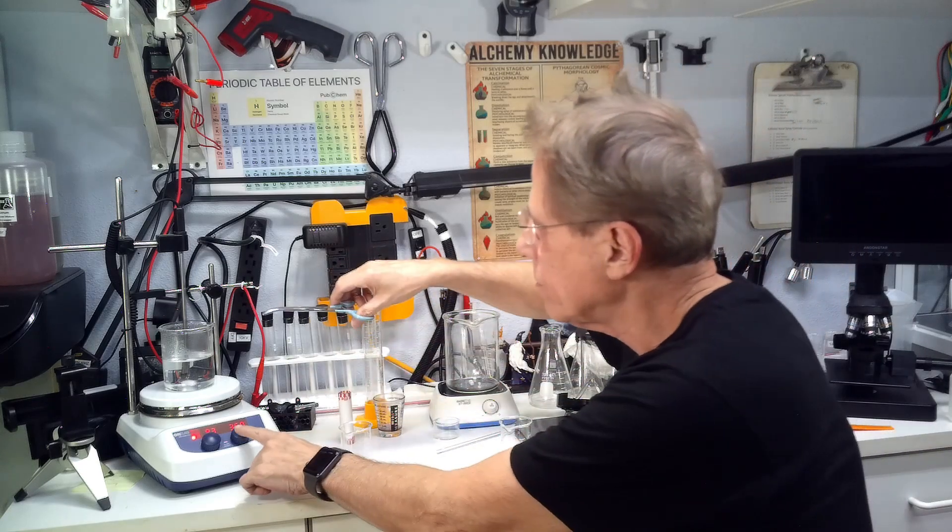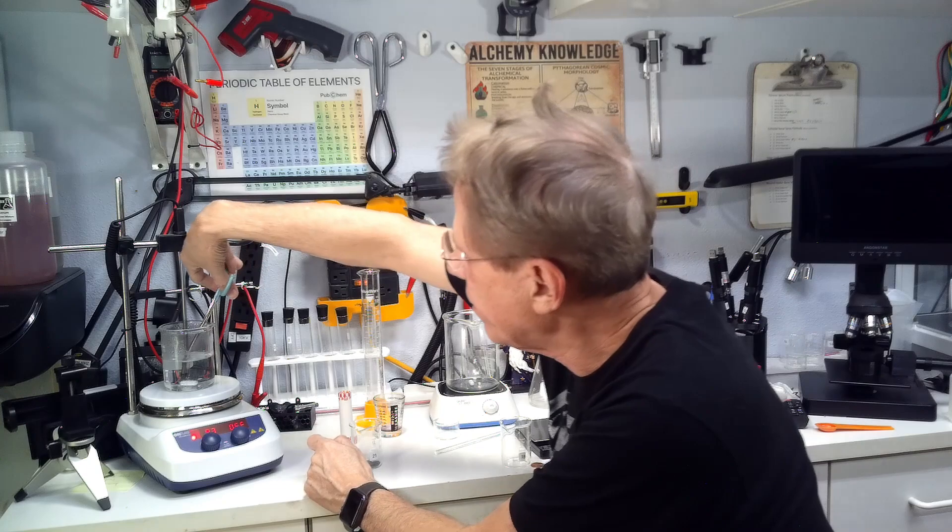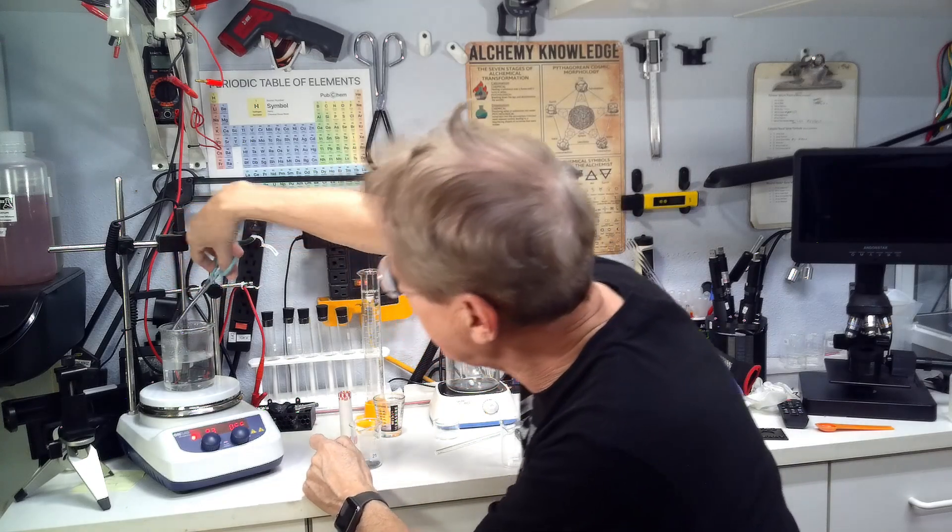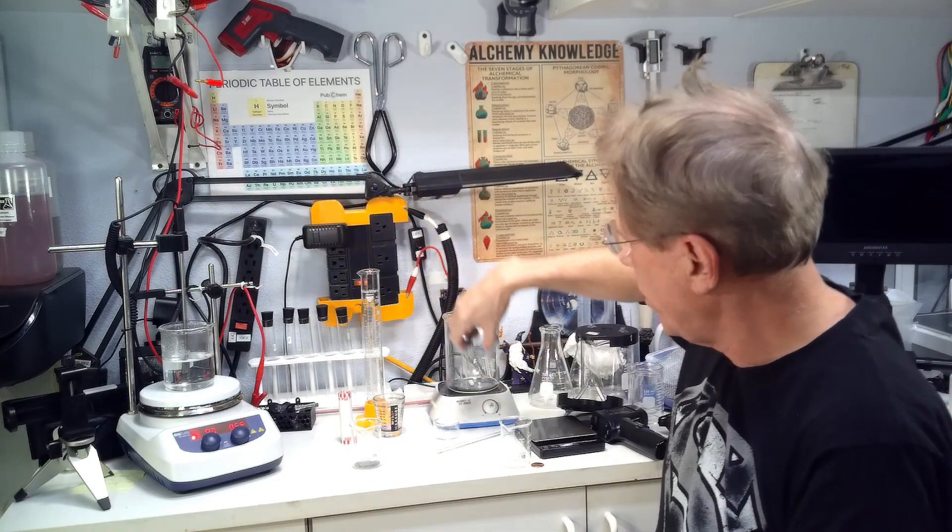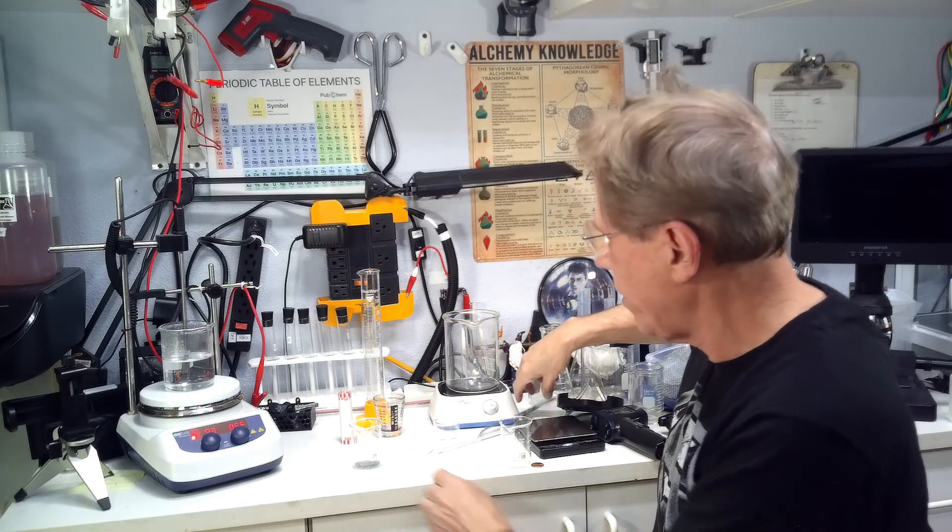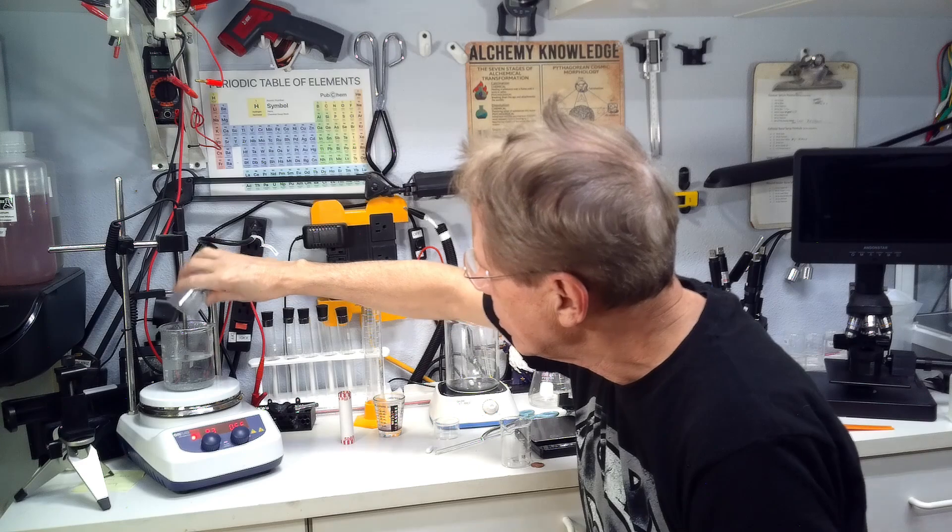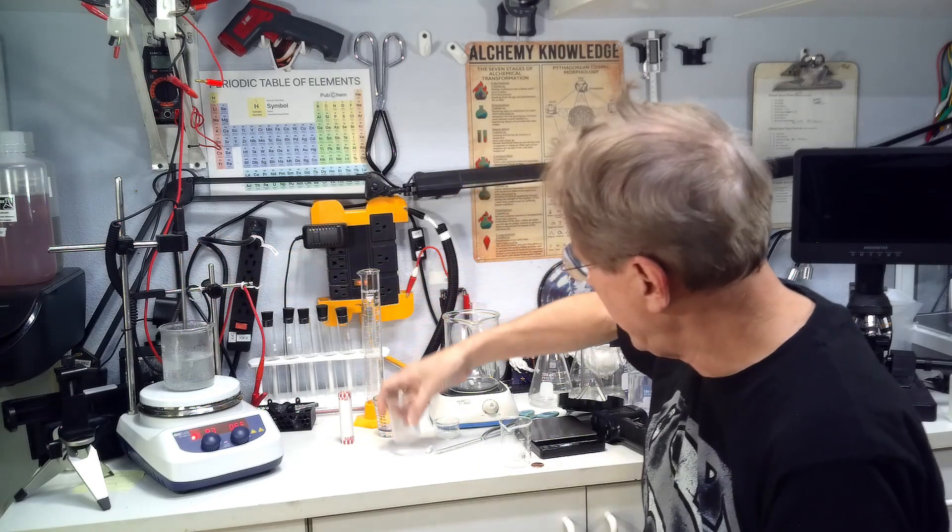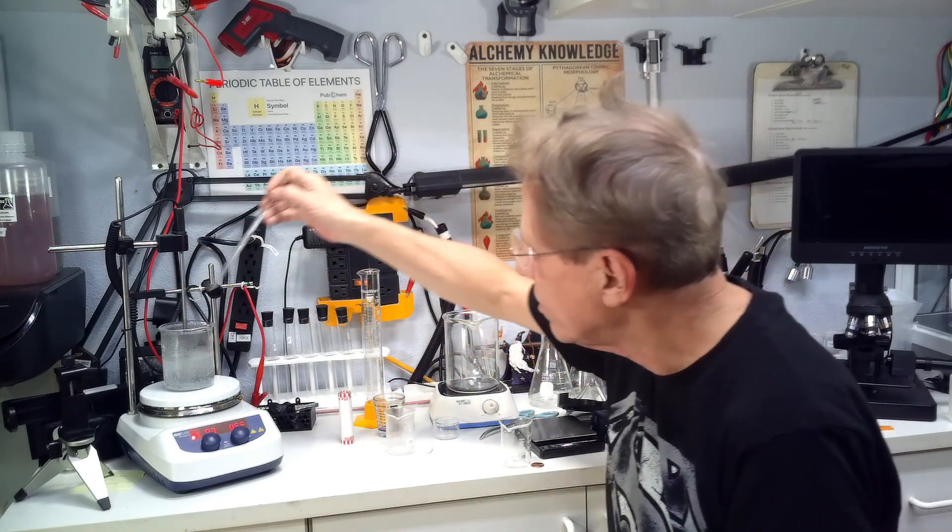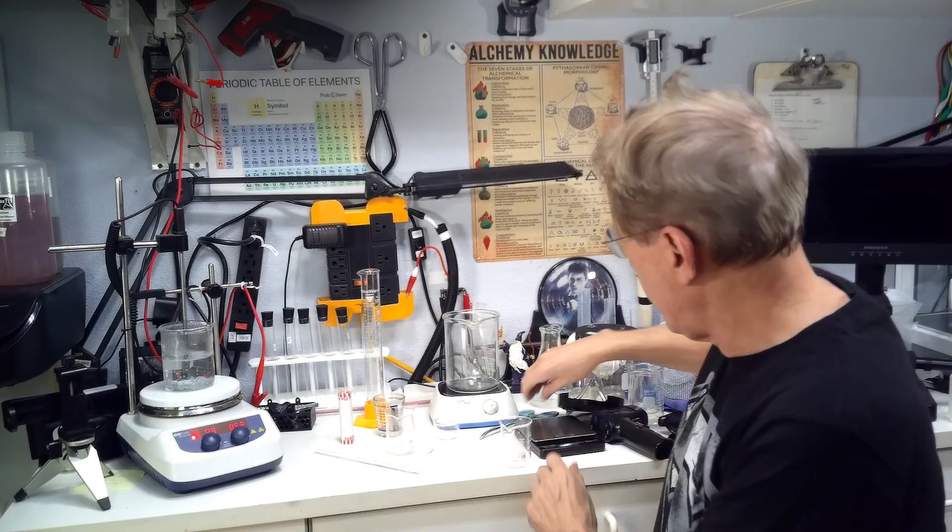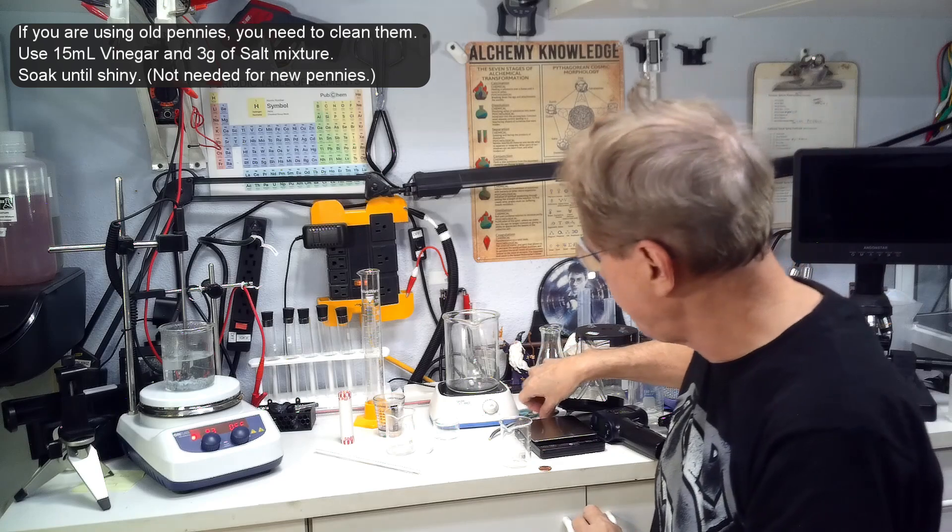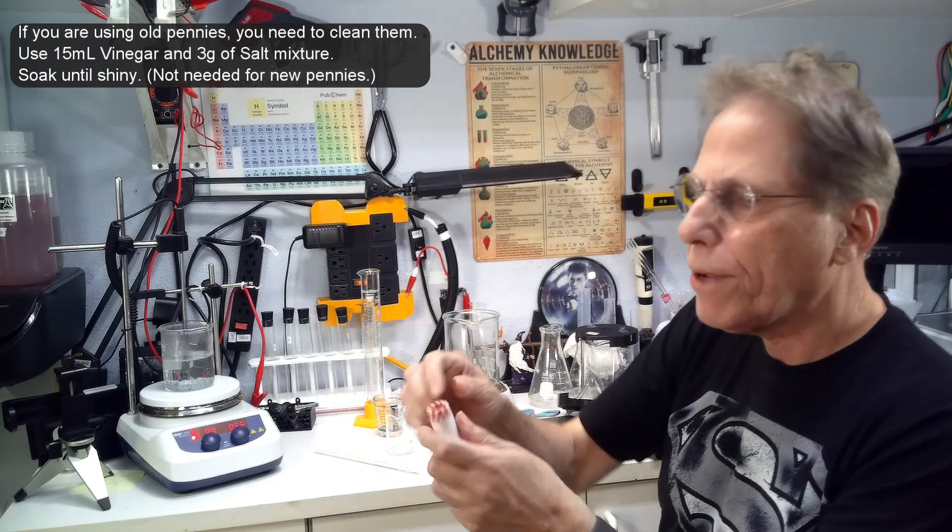So I'm going to turn off the stirrer here. I just wanted to make sure we had it all stirred. I'm going to remove the little stirrer bullet thing and we're going to pour in the zinc in the bottom. You're not supposed to touch these pennies. This is a brand new roll of pennies here.